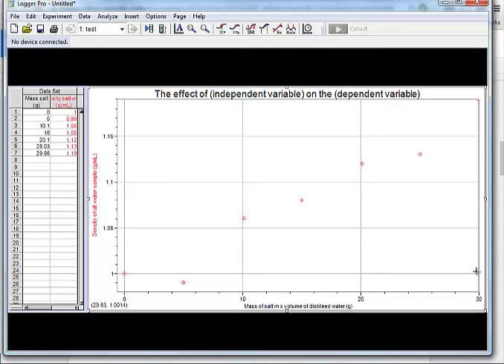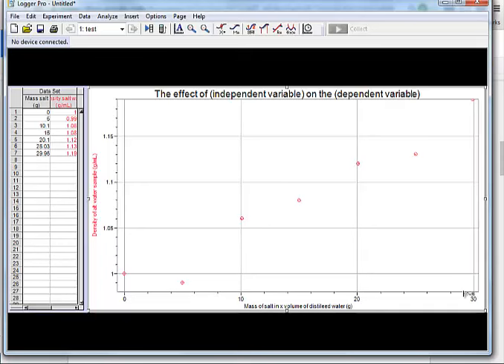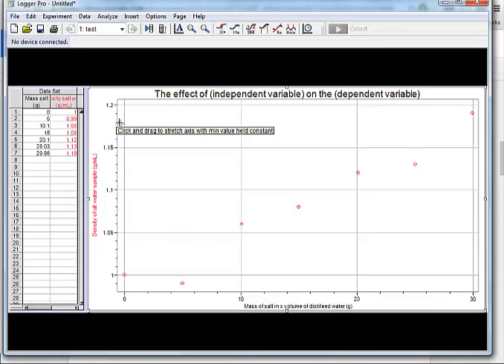And over here in the upper right-hand corner, I got a data point stuck right in the corner. I need to move that out. So I'm going to go down here. See that same emblem's over here. Pull it back from the edge. And then I'll pull it back from the top up here in the same way. Now I can see all the data points clearly. You with me?